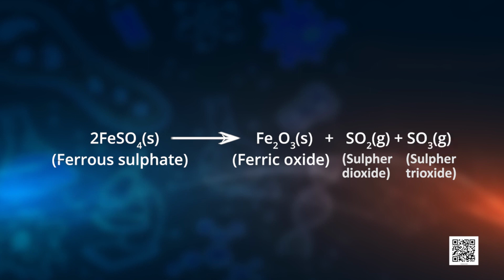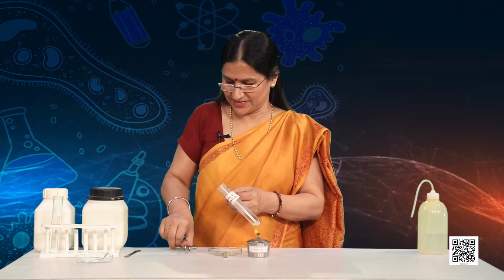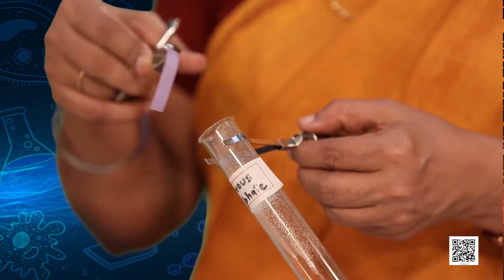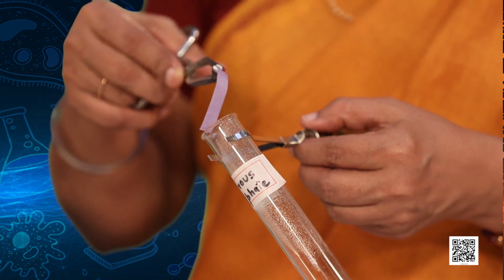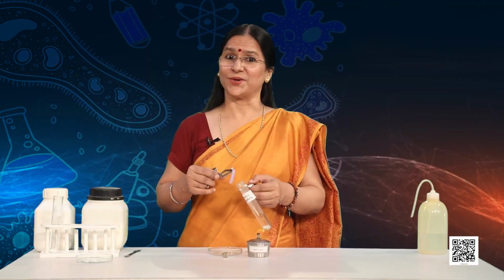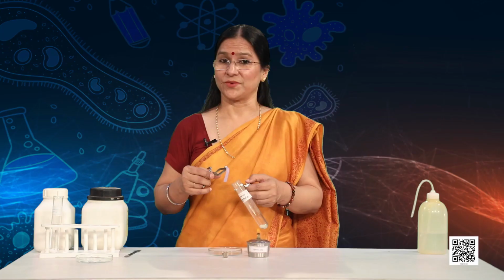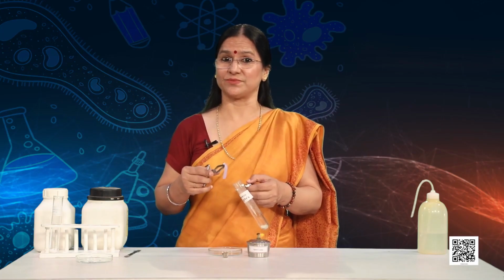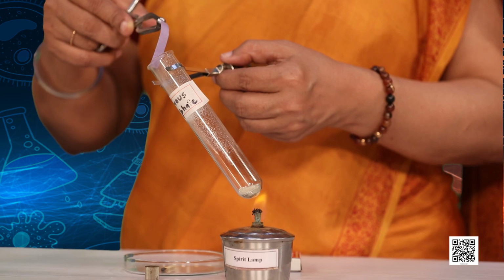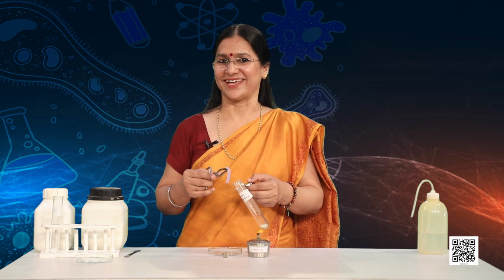Now friends, put on your thinking caps and tell me what will happen if I keep this moist litmus paper, the blue litmus paper, on the mouth of the boiling tube from where the gases are being emitted. You've already studied in your earlier classes about the change of the color of the litmus paper. So I'm sure you can tell me whether you will see any change in this blue litmus paper. And what would have happened if I would have kept a red litmus moist paper? Think. If not, explore and find out.